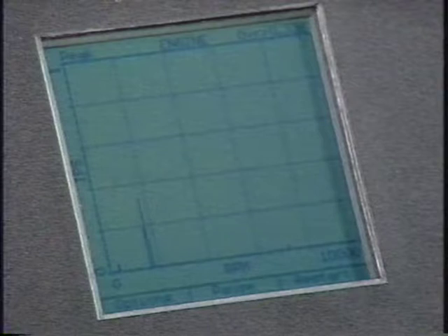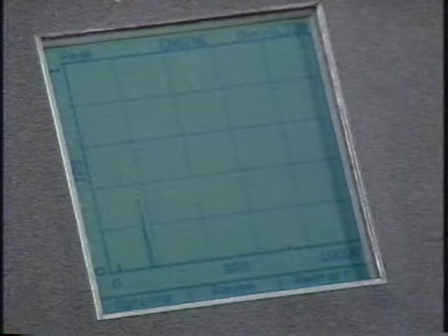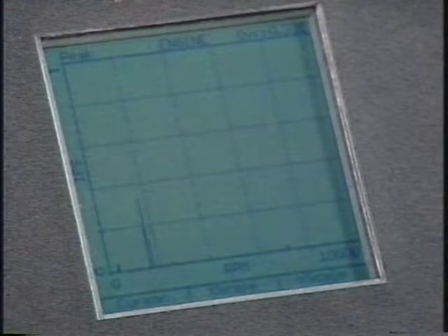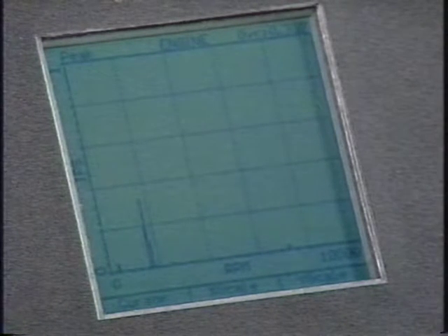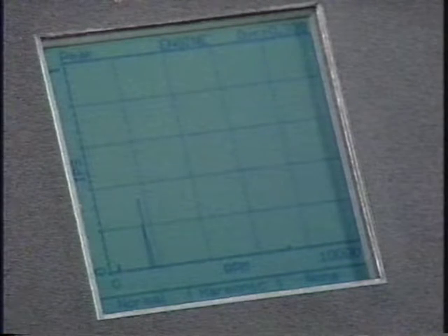When the spectra is displayed, observe the three boxes at the bottom of the screen. The first box, Options, corresponds to the F1 key. Press the F1 key and the boxes change to read Cursor, X scale, and Y scale. Press the F1 key again and the boxes change to Normal, Harmonic, and None.